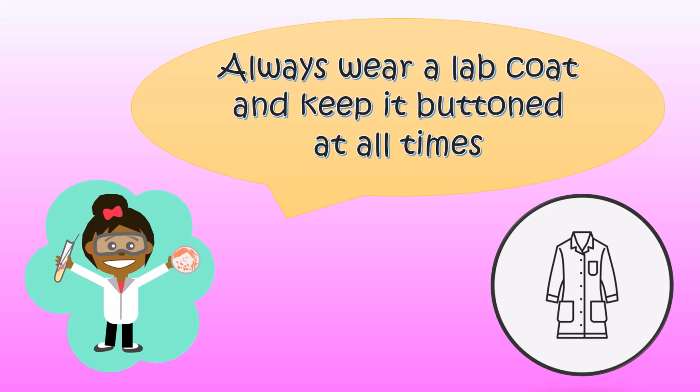The following general safety rule is that we must always wear a lab coat and keep it buttoned at all times. This is because the lab coat makes sure our body is protected from splash, spill, and even unanticipated reaction.